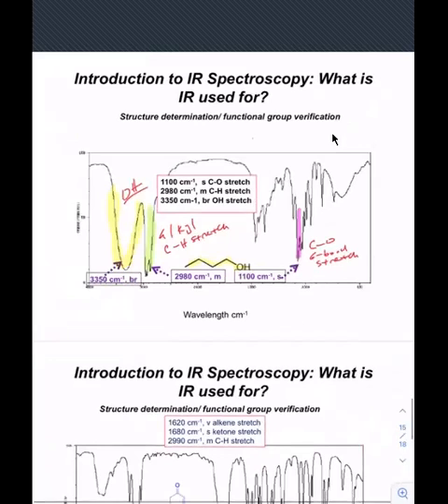So when you take an infrared, this is what it looks like. Unfortunately, we didn't get a chance to do infrared on our aspirin samples. But I think the group, not last semester, maybe the semester before, right before COVID hit, we were able to actually go up and take our aspirin samples. We have 2 infrareds. Actually, we have 3. But it's an FTIR, Fourier transform. It's much different.